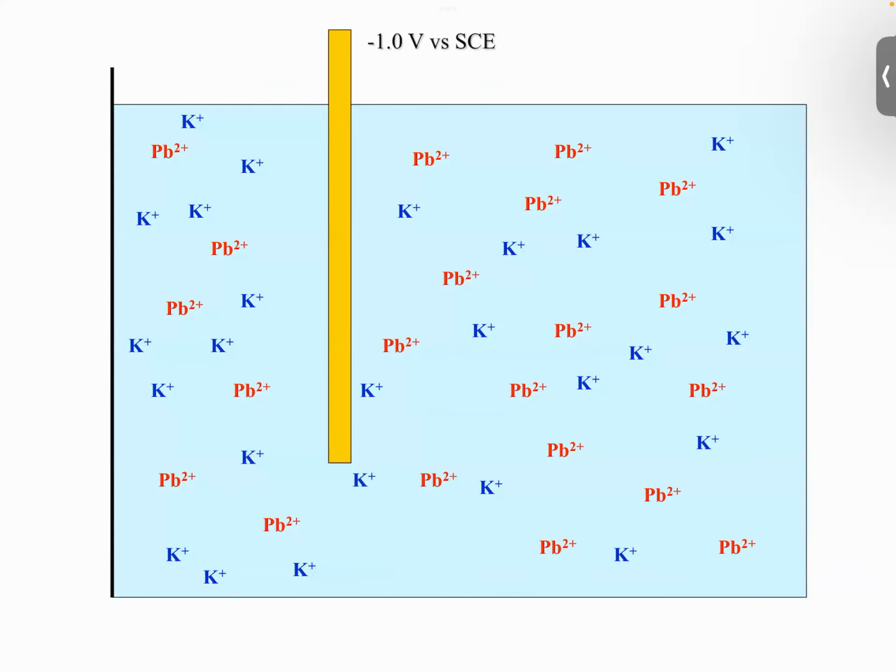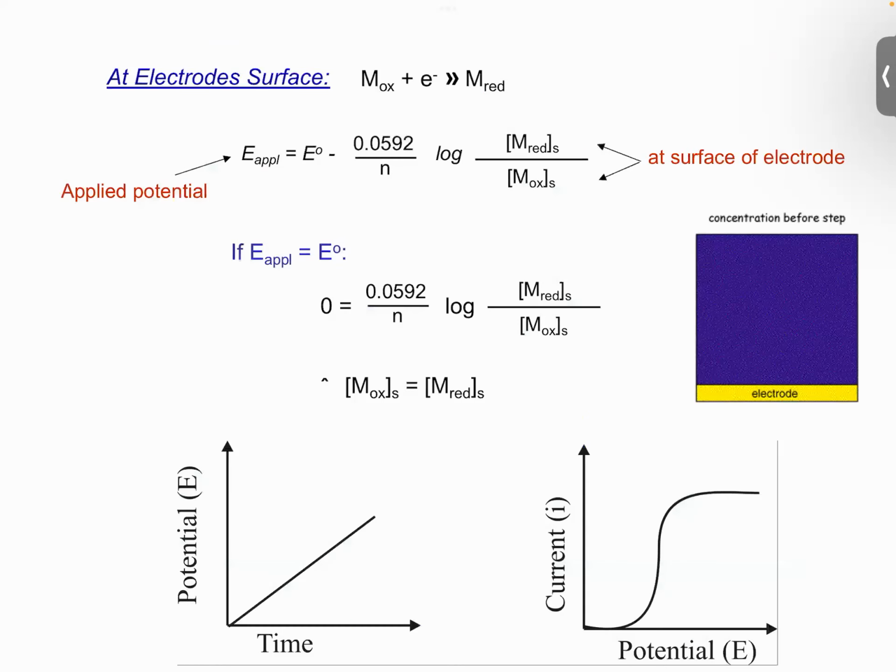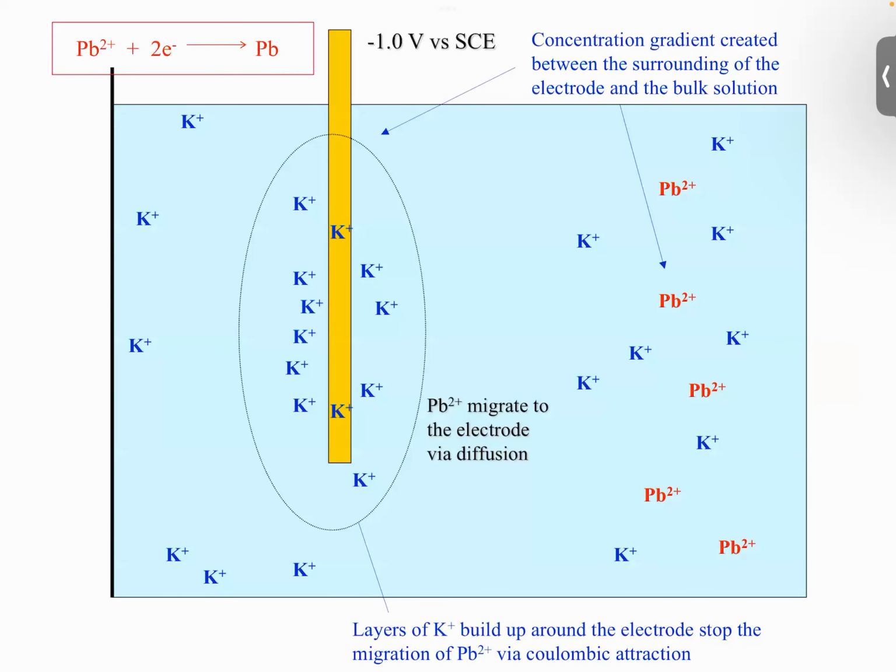Okay, so you can see this is the movement of ions towards the electrodes. Among the process, there are concentration gradients. Let me go back. This is what happens when we talk about movement of ions.